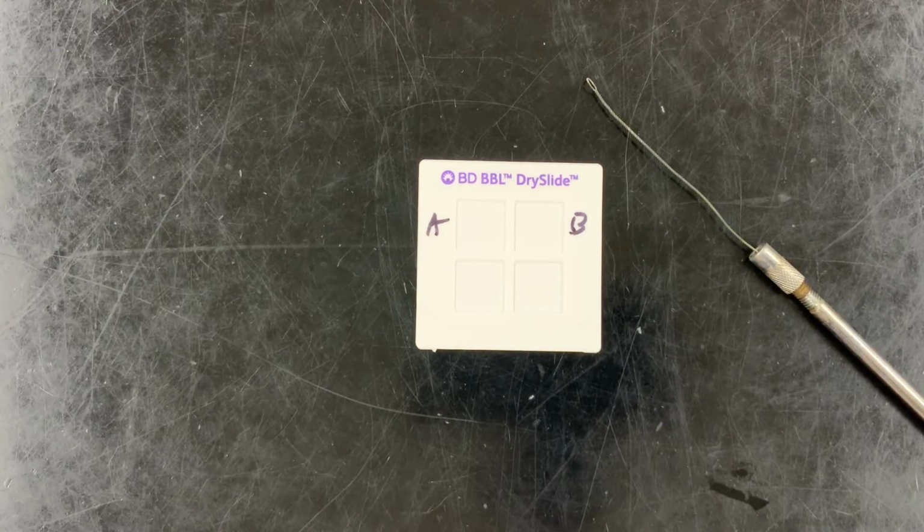So being able to determine whether something is an enteric bacterium or a non-enteric bacterium does a really large part in trying to identify the nature of this bacterium. Generally, most non-enteric bacteria are oxidase positive, whereas the enteric bacteria are oxidase negative.